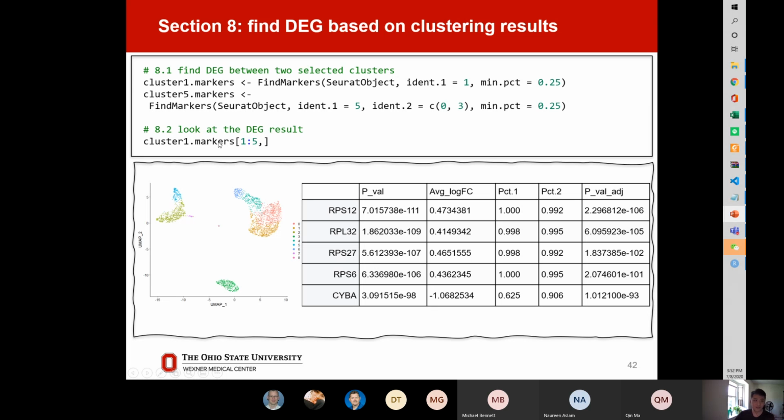And the final thing is the last part. What's the next step after we get those clusters? The short answer is, of course, we only know the number of clusters. We know there is a cluster, there is another, but do we know what cell type each belongs to?